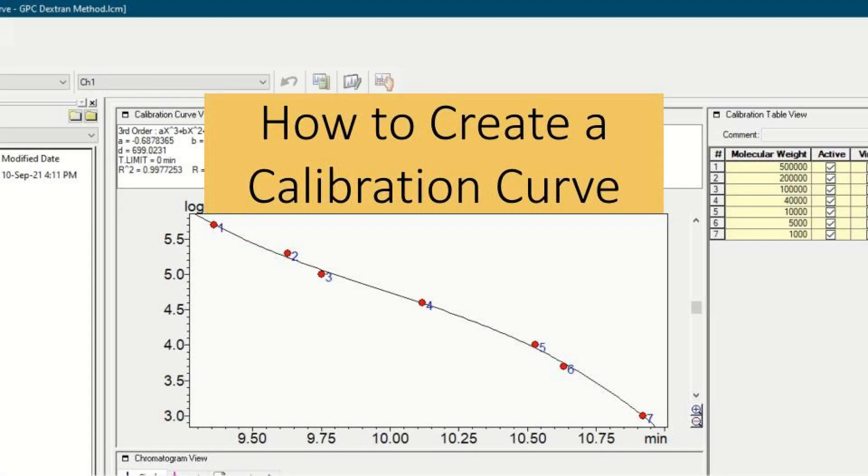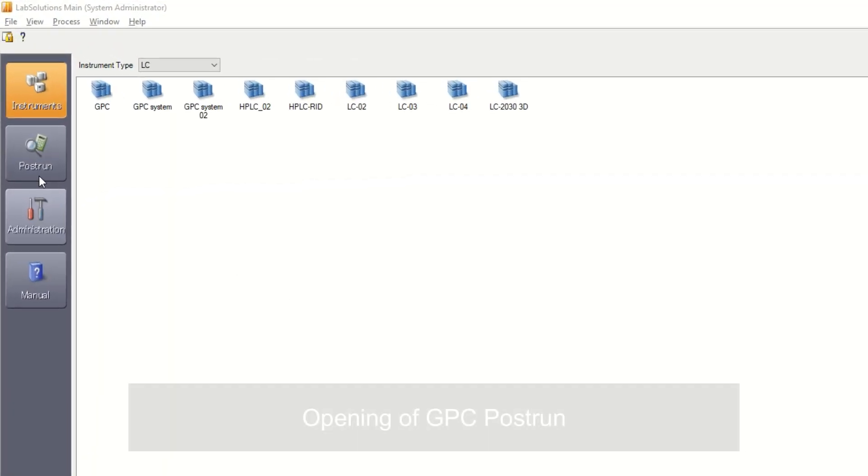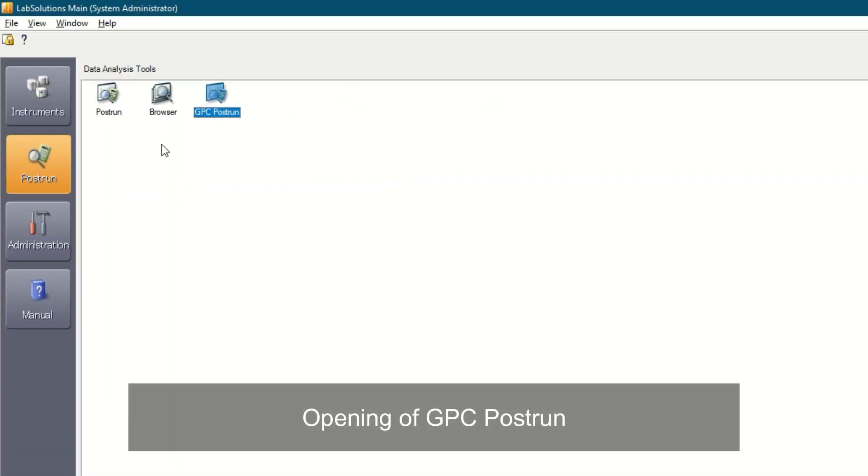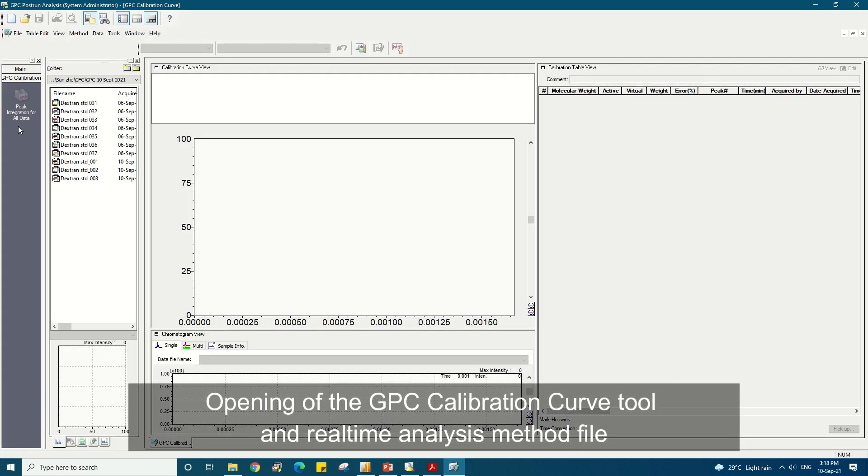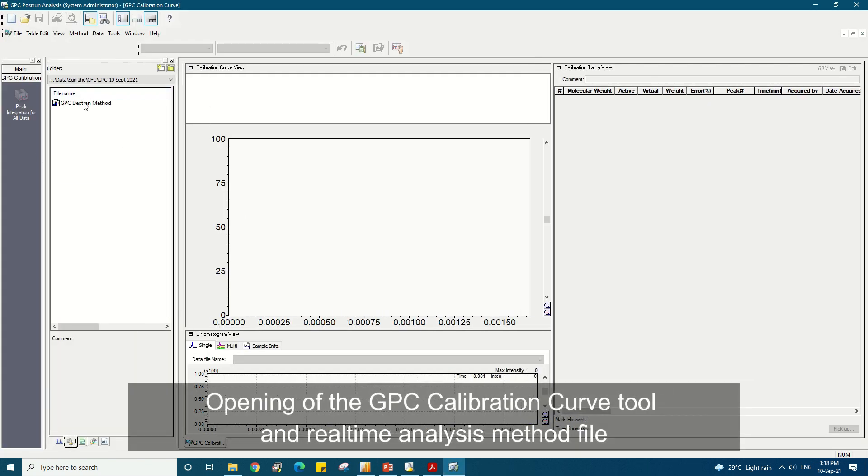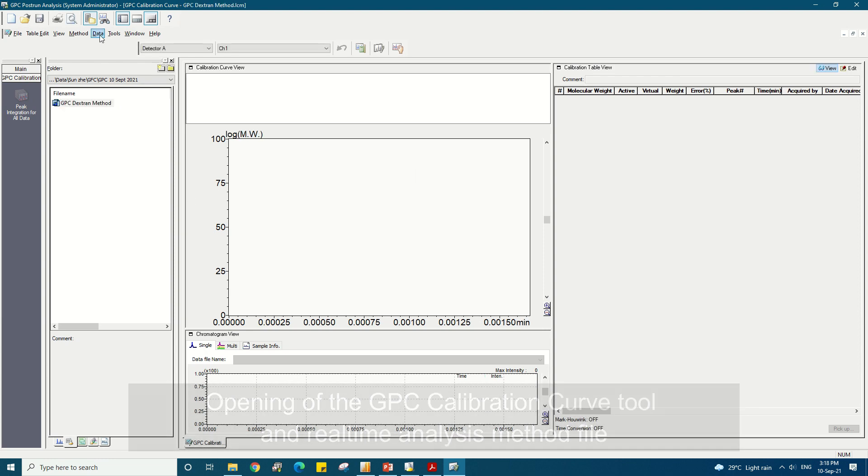After the real-time batch run is completed, we can start creating the calibration curve. In the post-run window, select the GPC post-run icon and open it. Open the GPC calibration curve tool from the assistant bar and select the method file used in the real-time analysis.